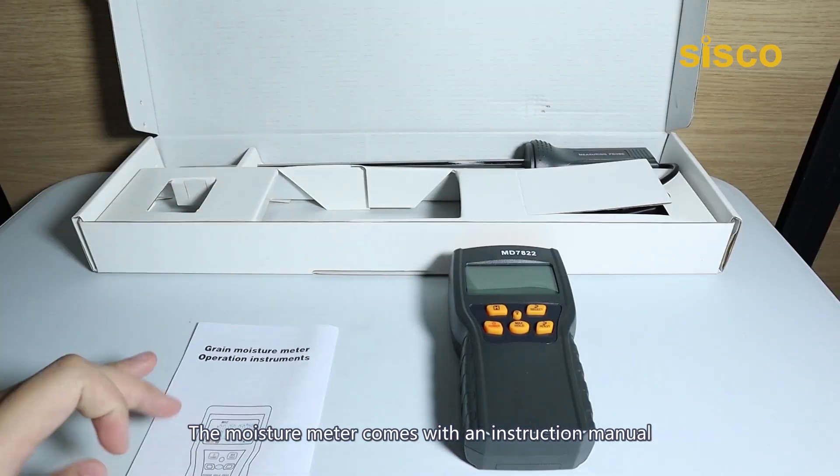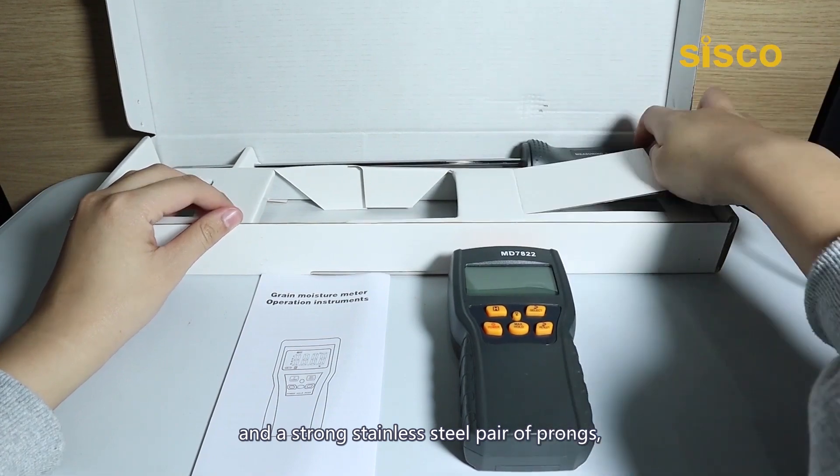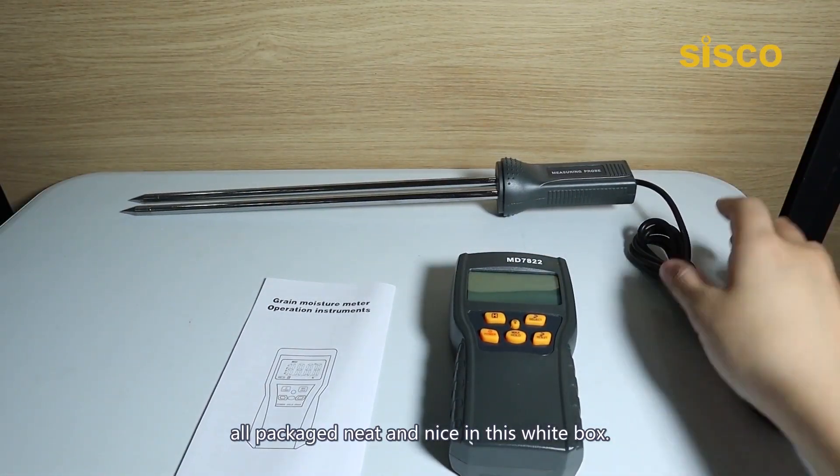The moisture meter comes with an instruction manual and a strong stainless steel pair of prongs, all packaged nicely in its white box.